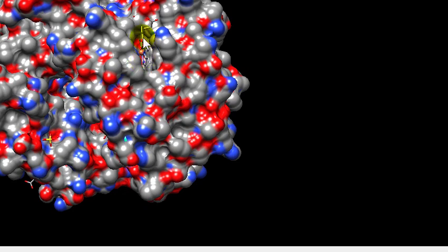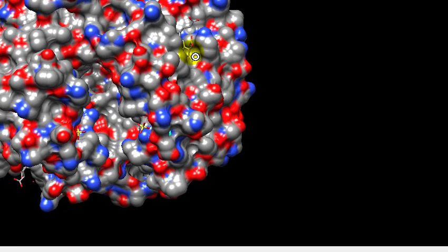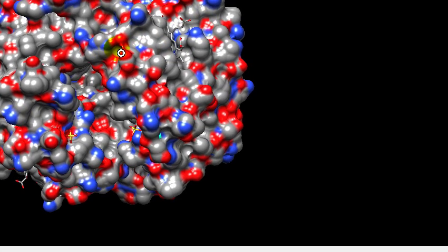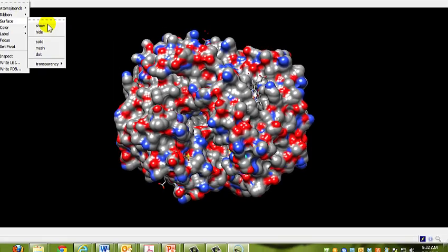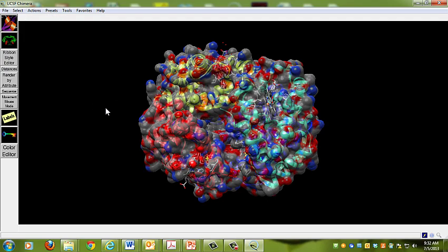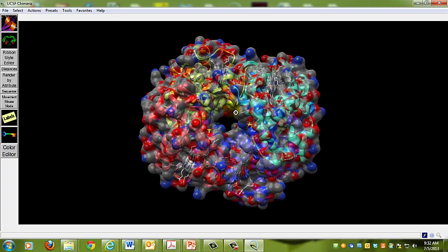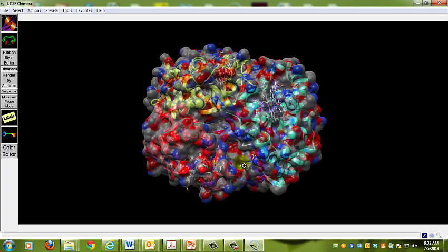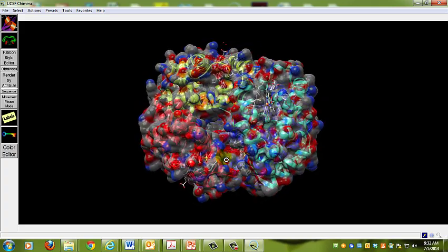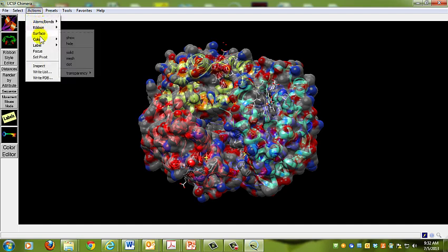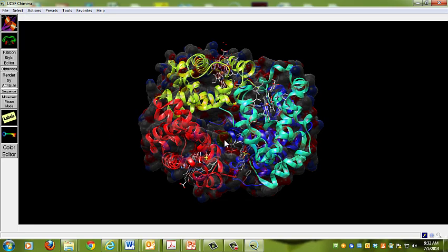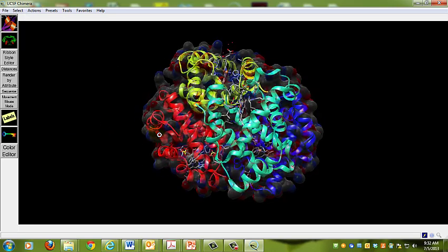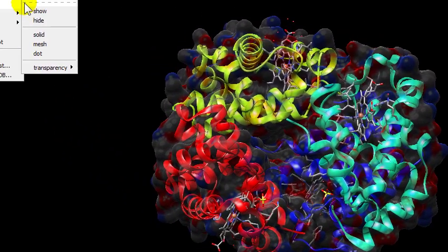You can go to actions, surface, transparency, and go to 50 percent transparency. You can see the ribbons in the background behind each subunit. They're slightly different colored subunits. You can change this transparency to different levels. You can go to 80 transparency, and that really shows you the ribbons back there. Now we're going to go back to surface and hide the surface.